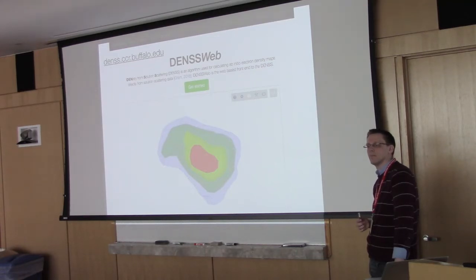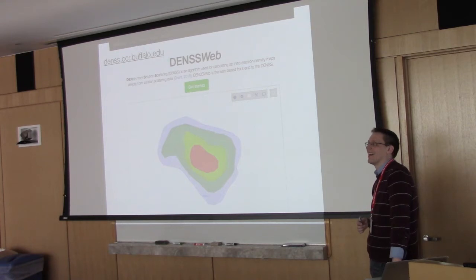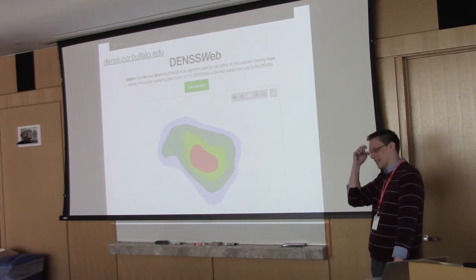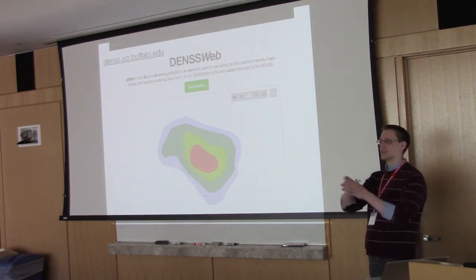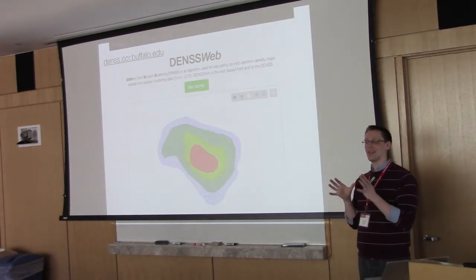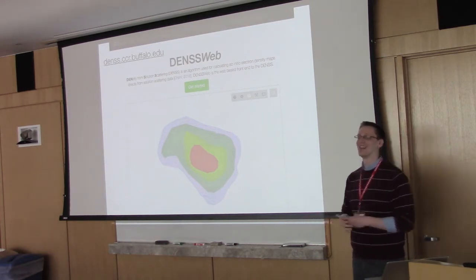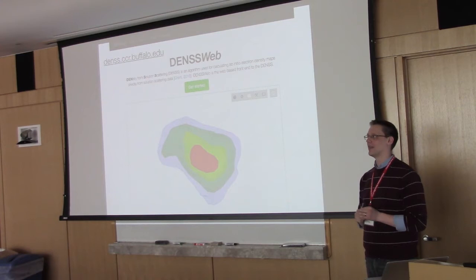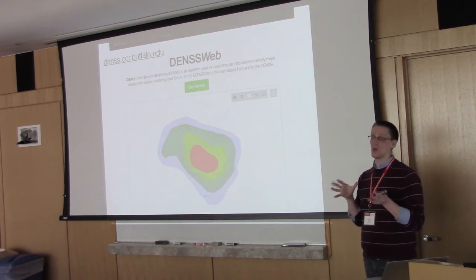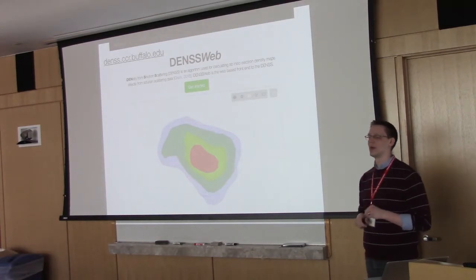How do you decide the weight factor for the connectivity restraint for the cases where you have low density bridges connecting? Yeah, so it's really stupid. Effectively, all it does is it looks at all the different blobs, and it says, find the blob that has the most density and get rid of all the other ones, and then just keep going. And so what'll happen is, most of the time it'll actually converge to one blob by the time you run this connectivity restraint.